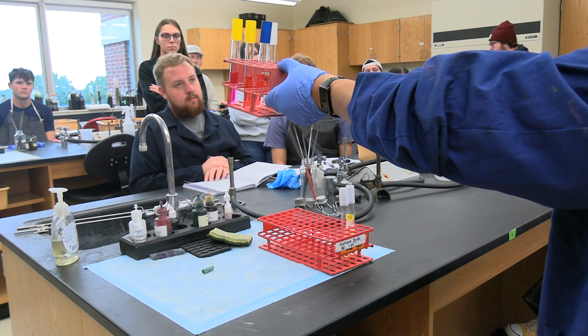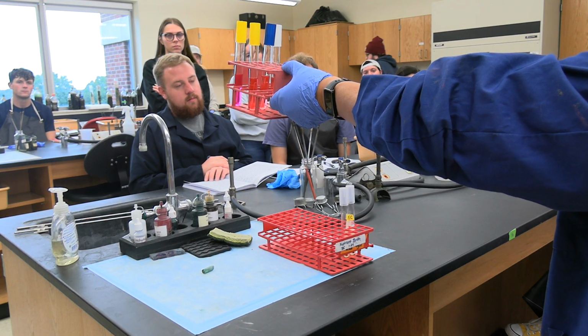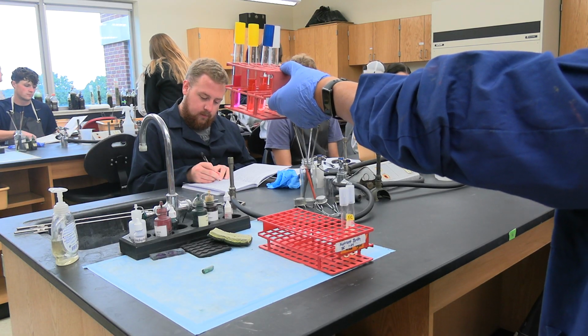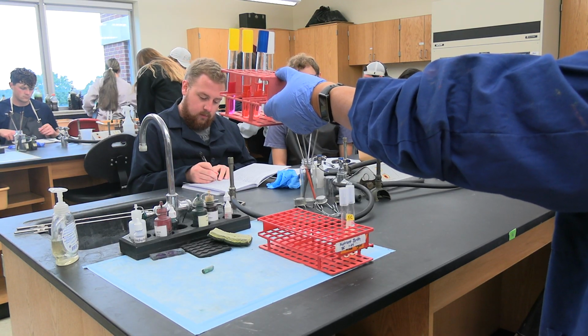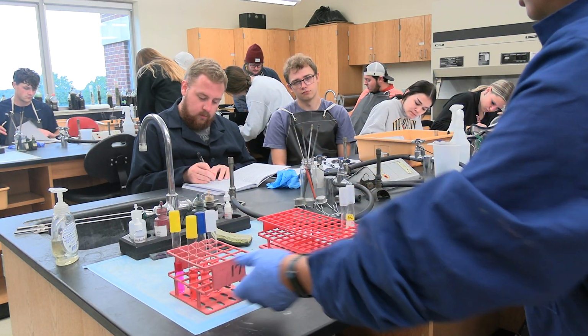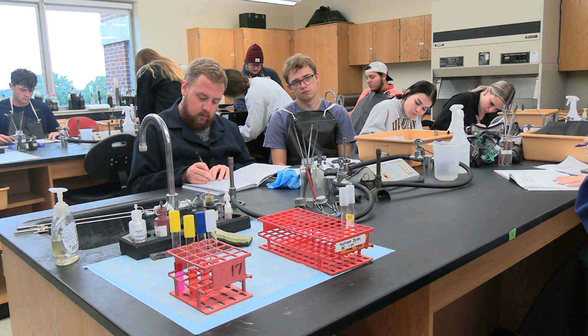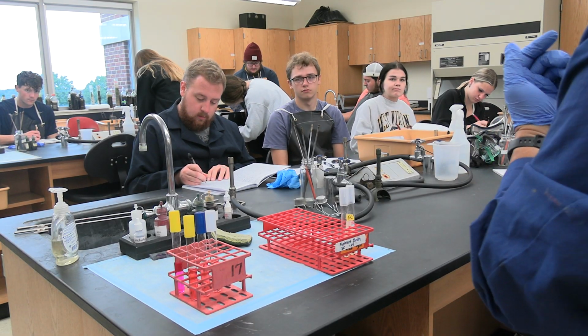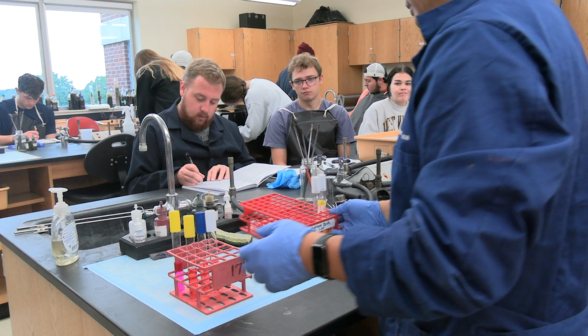So you can write down: the yellow color is glucose, the second one is sucrose, and the white color is lactose. We have the label on the rack already, so you can go there to do it. That's very important. Do not mess it up.